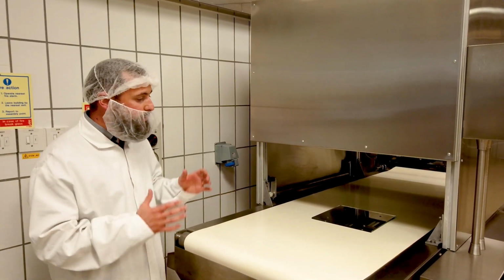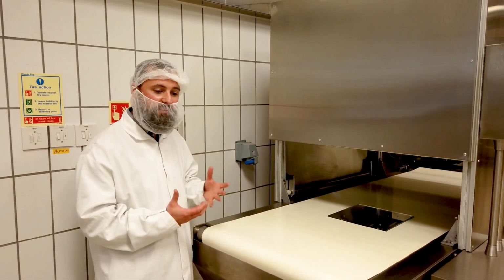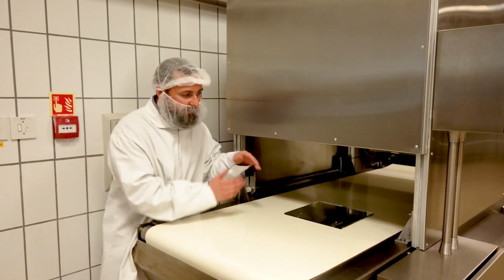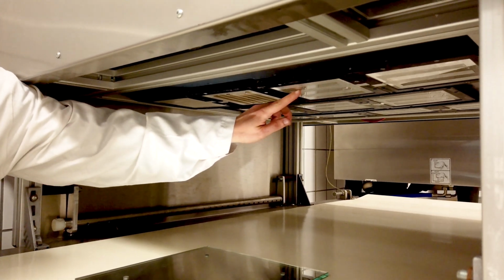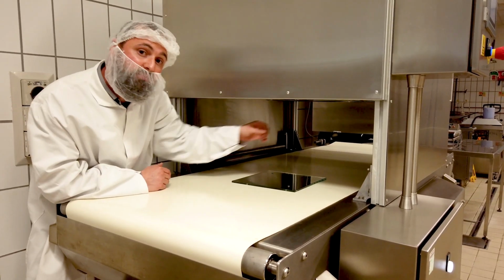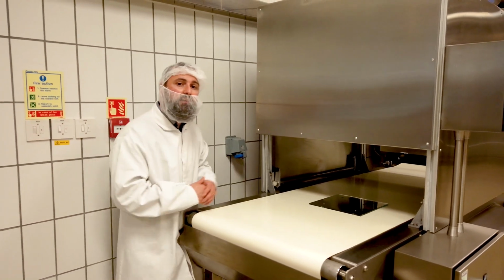The way that we generate plasma is by applying electricity to a gas that we're trying to excite and convert into chemical reactive species. Here we have two sets of electrodes that we're trying to sandwich together between quartz plates. And just on the edge here is where the plasma discharge will form, and all the reactive species have antimicrobial properties that can cause inactivation of bacteria. We're exploring how to optimise this technology to get real commercial application.